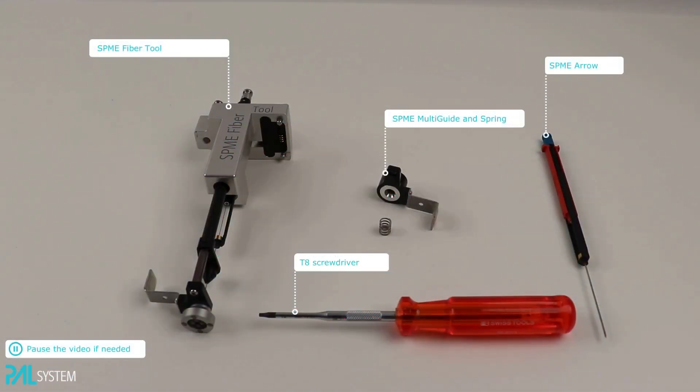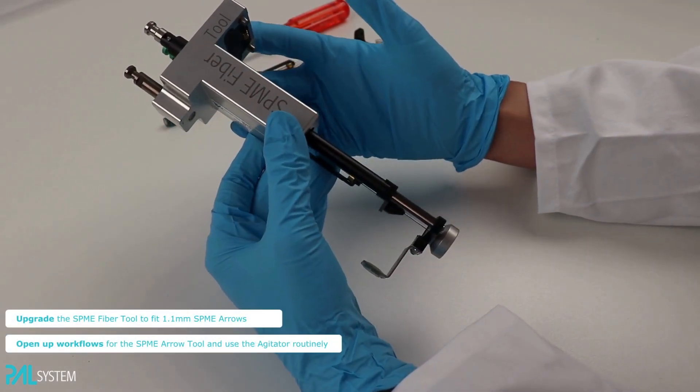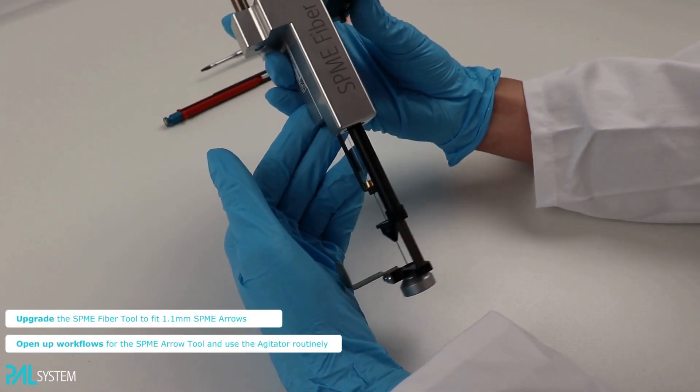The SPME Multi-Guide can be installed in SPME Fiber and Arrow Tools. It allows SPME Fiber Duels to use 1.1mm SPME Arrows, enhancing the sensitivity and robustness of the analytical workflow without any changes in the method. This upgrade does not require any extra modules or tools.